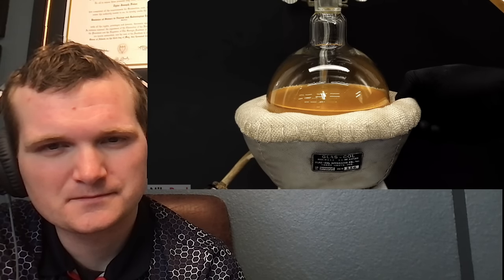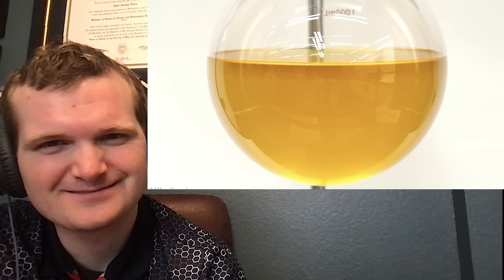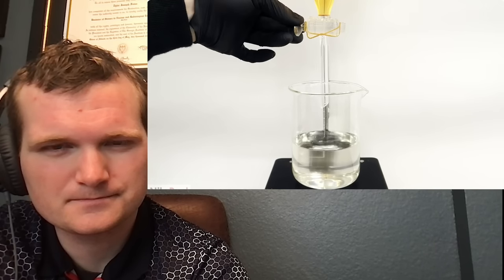When it was done, I turned off the stirring and took away the heating mantle. I let it cool down for around 20 minutes and then poured it all into a separatory funnel and waited a few minutes for the layers to separate. I then drained the bottom layer — mostly water containing the sodium phthalate — into a beaker. The upper one was a mixture of isopropyl alcohol and isononyl alcohol, and I poured it into a separate container.